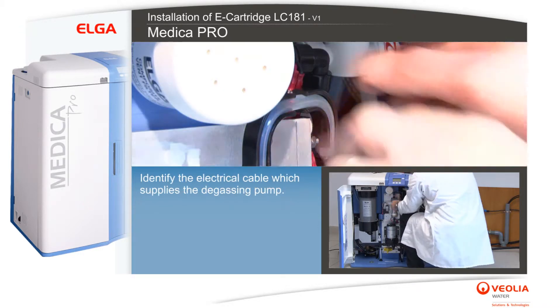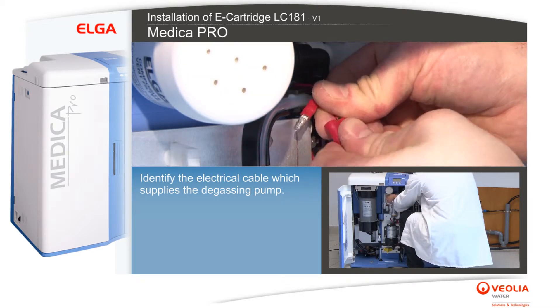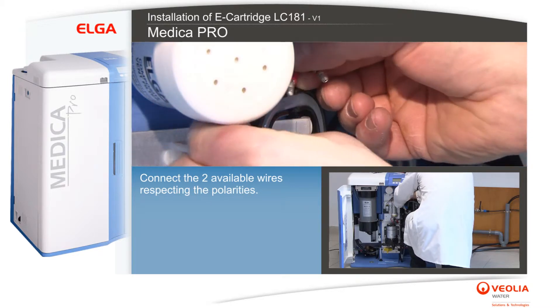Identify the electrical cable which supplies the degassing pump. Connect the two available wires, respecting the polarities.